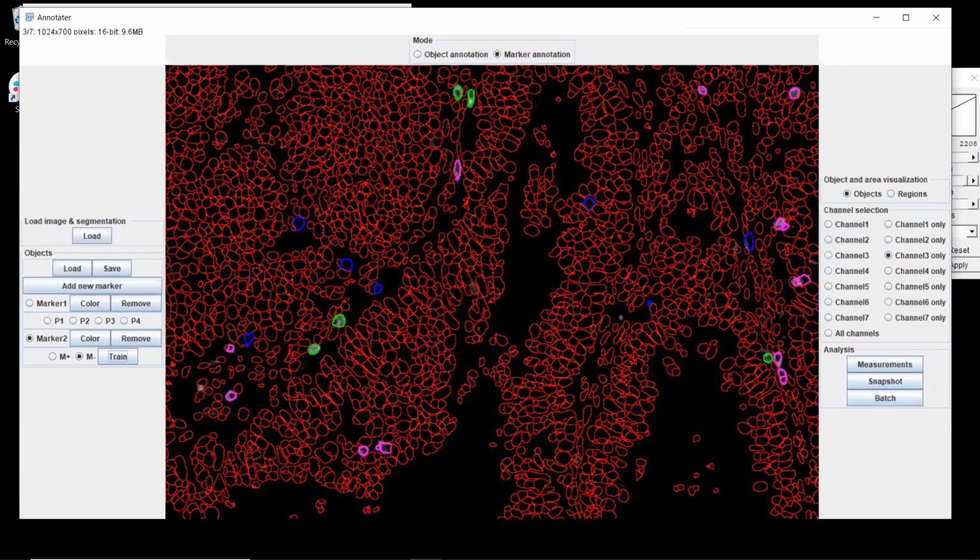The thing is that sometimes you might see weird behavior: you train your classifier, it's fine, you add a few nuclei, and suddenly you have lots of positive nuclei, and if you look at them, they're all big or they're all small. It might be because, for your positive nuclei, you only selected large nuclei, while you also have small nuclei.